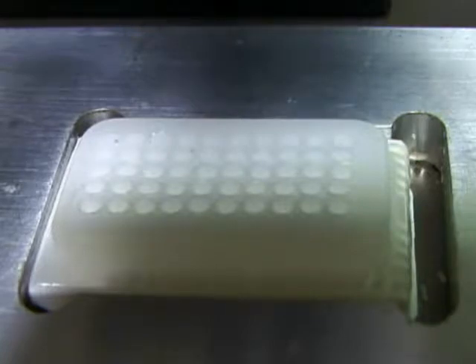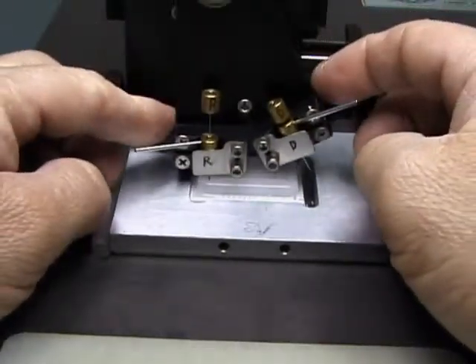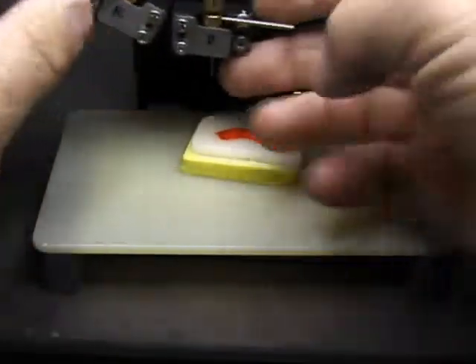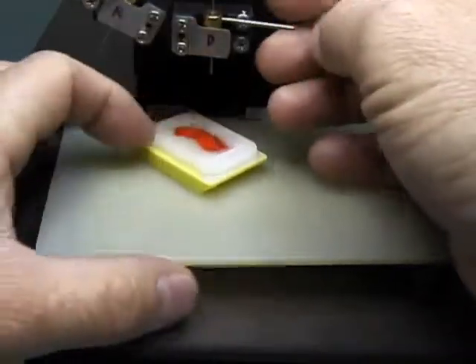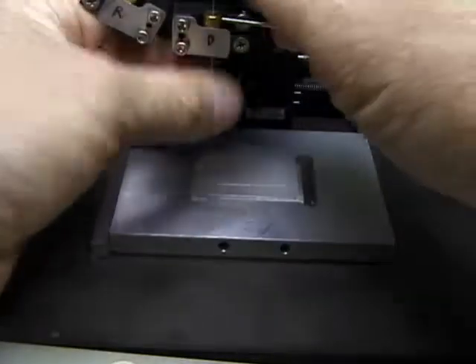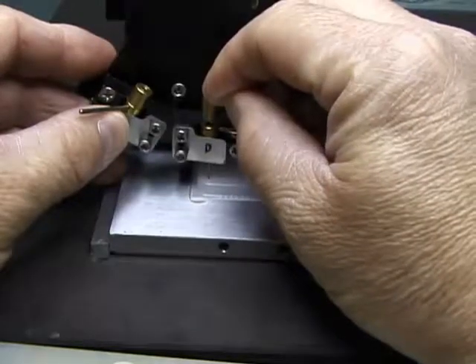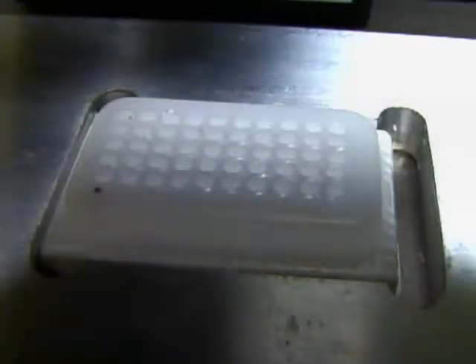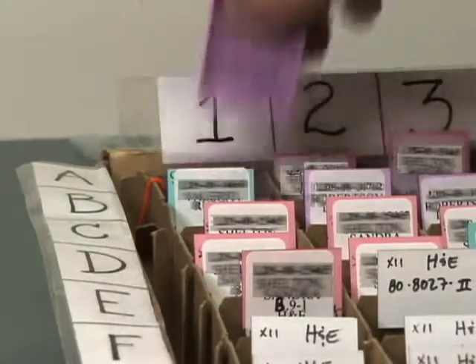Now that all the holes are punched, you can begin to fill with donor tissues. I am placing a 0.6 millimeter location marker at the number one position before I begin. Remember to work from your grid paper to keep order to the array.